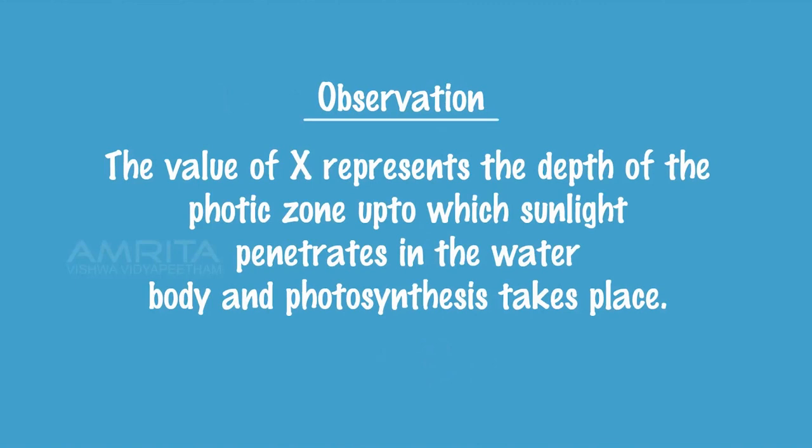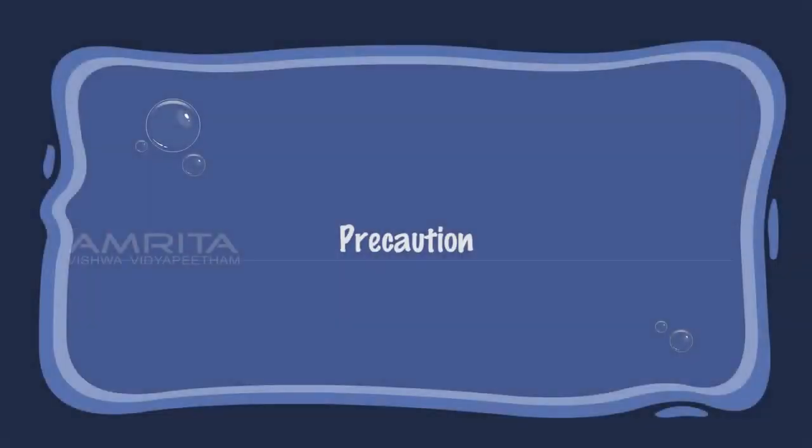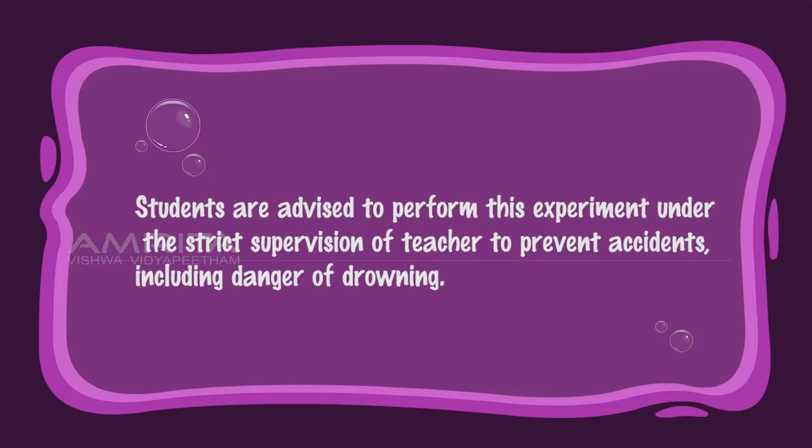body and photosynthesis takes place. Precaution: Students are advised to perform this experiment under the strict supervision of a teacher to prevent accidents, including danger of drowning.